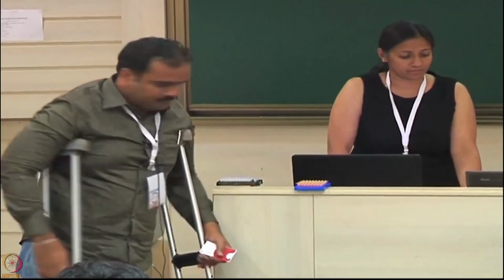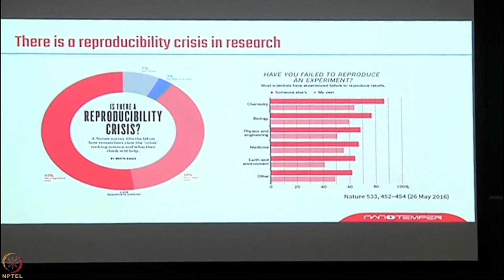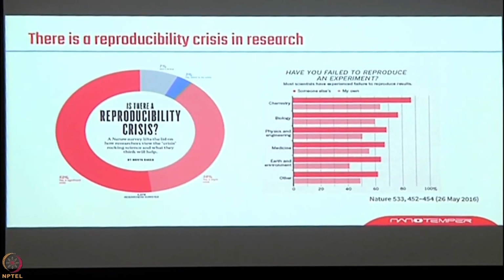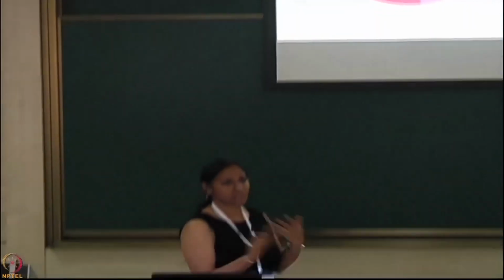Saji, please go ahead. So have you ever asked yourself whether whatever protein you are purifying is pure or not, I mean whether that can be used for your future assay experiments or not? That's a very big question that always comes to the mind of any researcher. So before going for any assay, you run a column, you do an SDS-PAGE, or you do spectrophotometric analysis.